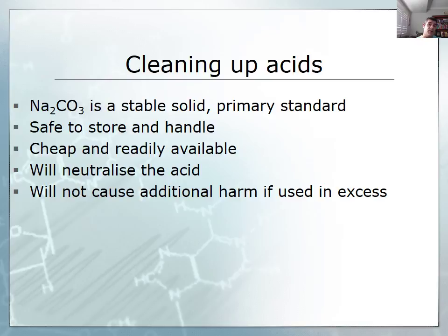So one of the important things about sodium carbonate is it's stable, it's a solid, and it's also a primary standard. So we know whatever we use, we can be fairly sure that it's not going to be reacting in the environment, it's not going to be changing its pH and causing those sorts of problems. It's safe to store and safe to handle, it's readily available, and it's very good for neutralizing acids. So obviously, being a weak base, we can put a large amount of that in to neutralize even a strong acid and return that pH back to 7.